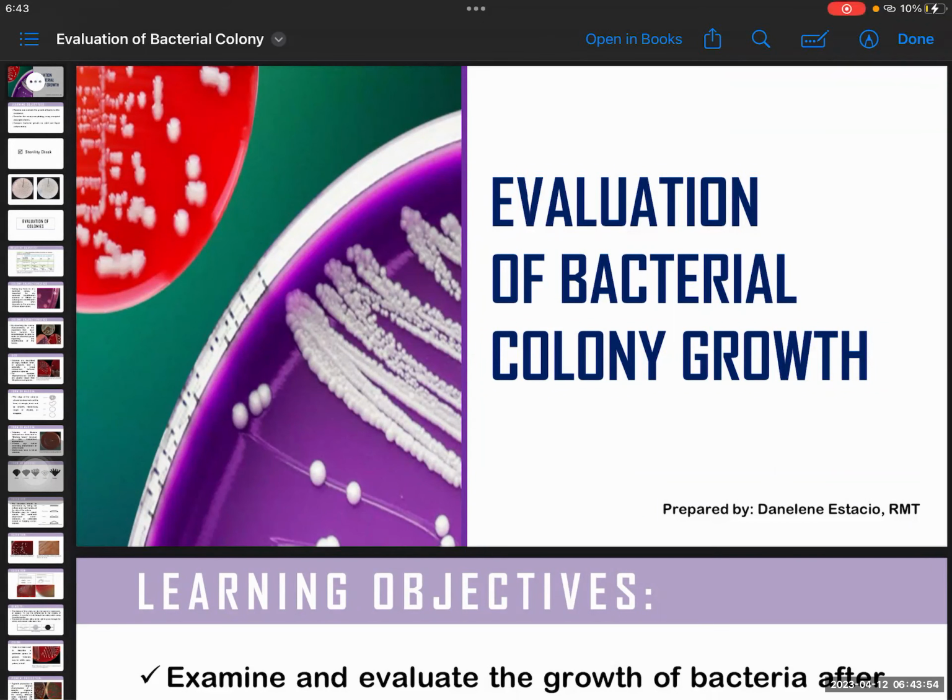So from the gram stain, yes, and then some of the staining techniques that we have recently learned, the stain for the flagella, stain for the endospore. Again, these will provide us with more clues.